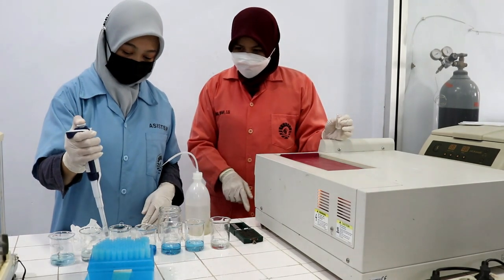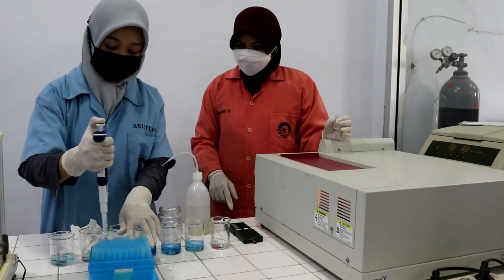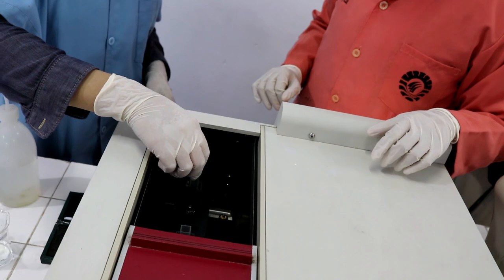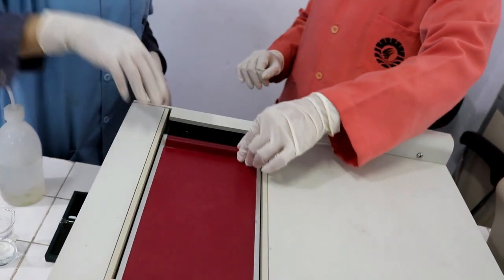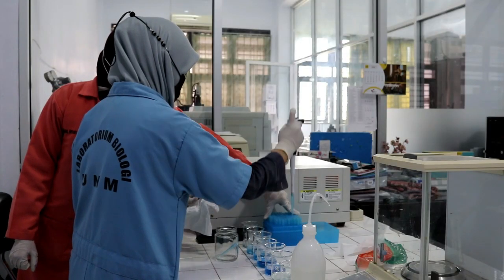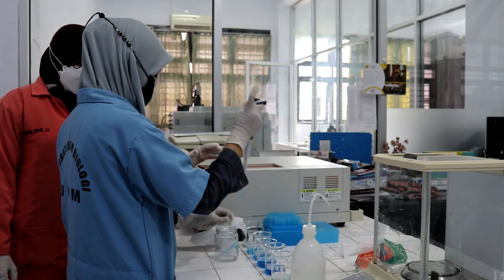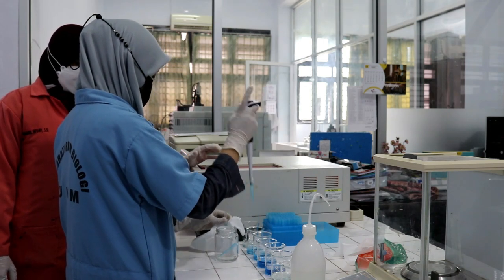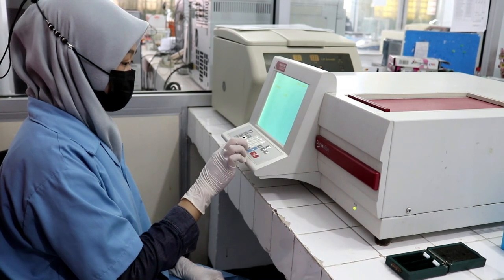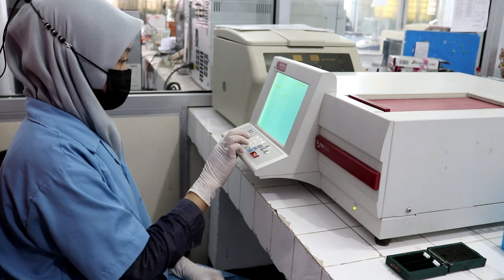Spectrophotometer for UV visible light. It is a tool that uses spectrophotometer technique to detect ultraviolet and visible light. This tool is used to determine the absorption of ultraviolet or visible light by a solution-based material. The amount of light absorbed by the substance in the solution determines the concentration of analyzed solutions. In this case, the Lambert-Beer law can be used to describe the relationship between light absorption and substance concentration in solution.